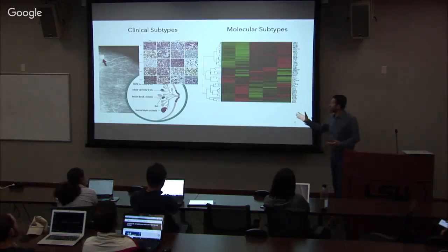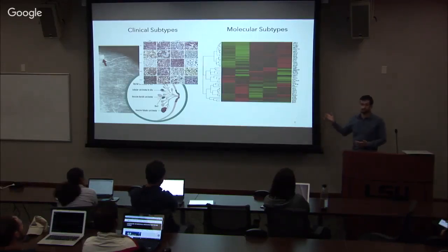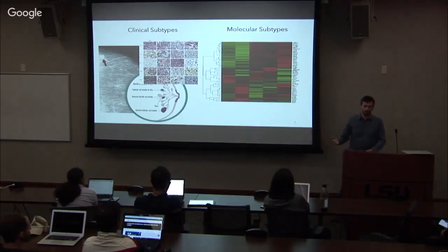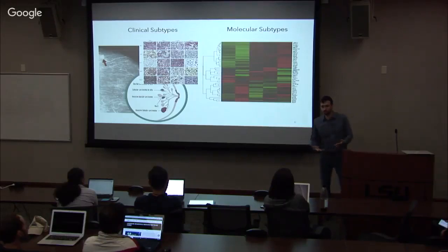And so we can look at something like a gene panel, which shows us a little more information: more genes, and also high expression levels, medium or normal expression levels, and low expression levels. That's where we get the terms overexpression, underexpression, and standard expression, or no change in expression.